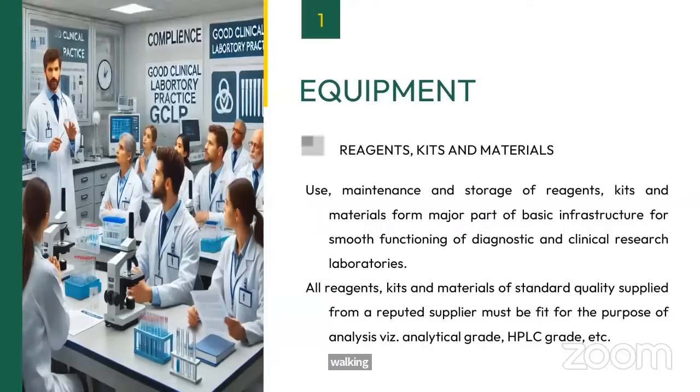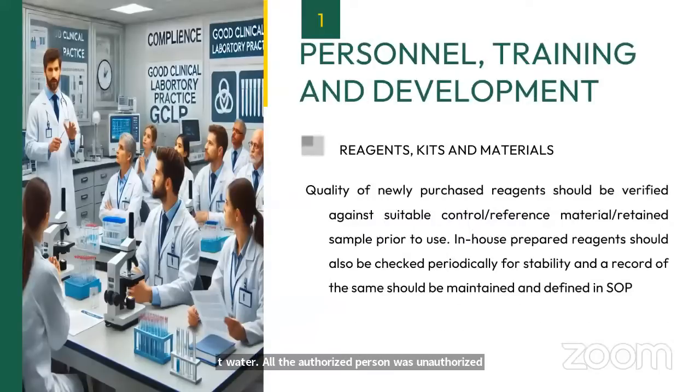All the reagents, kits, and materials of standard quality supplied from reputed suppliers must be fit for the purpose of use. So, IVD certified materials, certified reagents, HPLC grade water, analytical grade water should be appropriately available from authorized persons and authorized suppliers. Quality of newly purchased reagent should be verified against a suitable control.